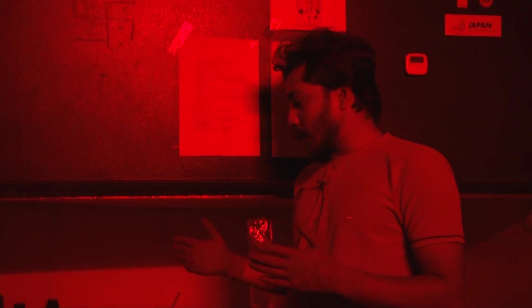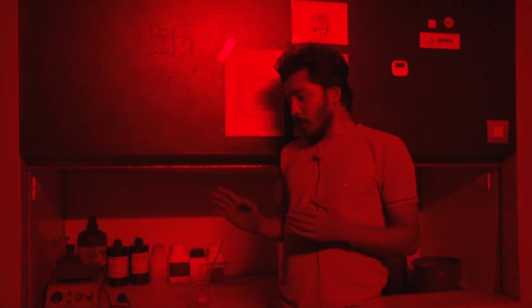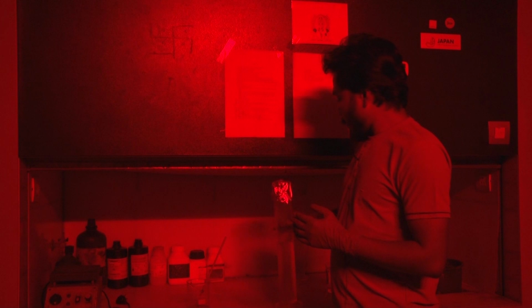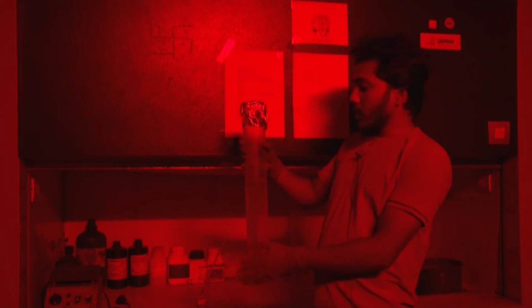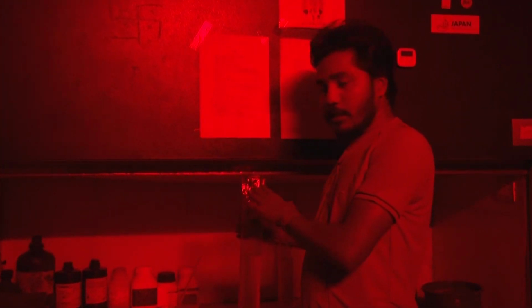We will use diluted HCl with 1 normal, because if we use concentrated HCl, as soon as you pour it on your sample it will react with the carbonate, and an exothermic reaction will occur with very high energy. Sometimes there can be an accident in your lab. To avoid the accident, you have to use the 1 normal HCl to dissolve the carbonate. In this flask, you can see this is the HCl with one normal. We will pour this HCl onto the sample.